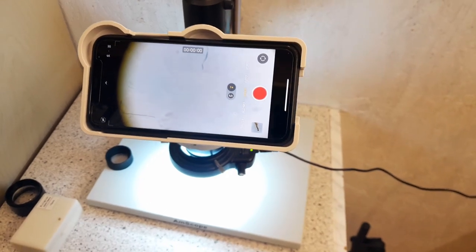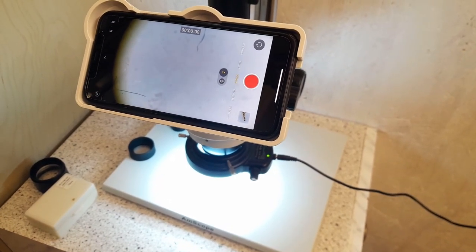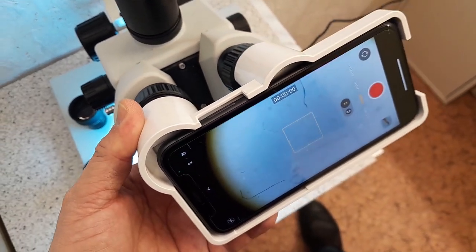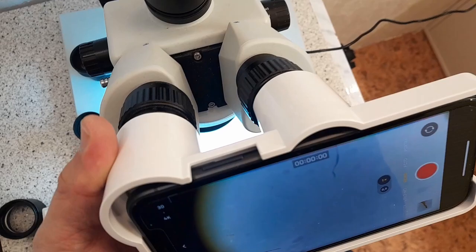I first connected the mobile phone adapter to my stereo microscope to have a first look here and as you can see it rests on the right eyepiece and therefore the mobile phone is kept horizontal.